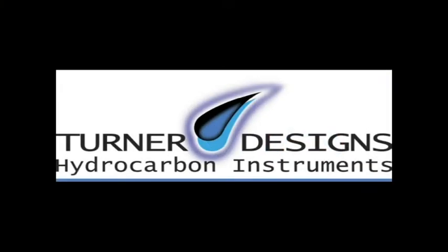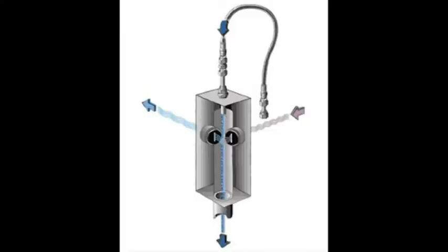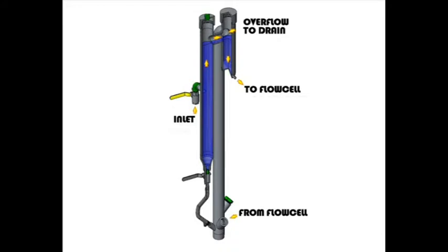In 1994, the TD-4100 series oil and water monitors were originally designed with an atmospheric, non-contact, falling stream flow cell to prevent the fouling typical of full-contact flow cells. With the falling stream design, it is important that the stream exposed to the light beam be constant in diameter and laminar flow. The best way to assure constant diameter and laminar flow is with a constant head device we call the bubble trap, also known as a deaerator.